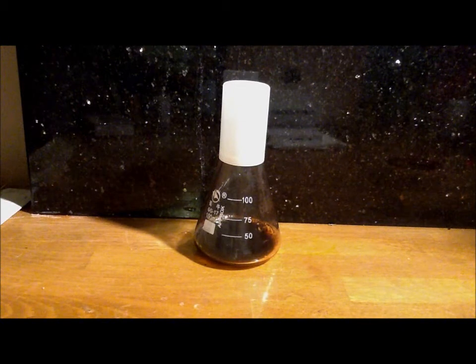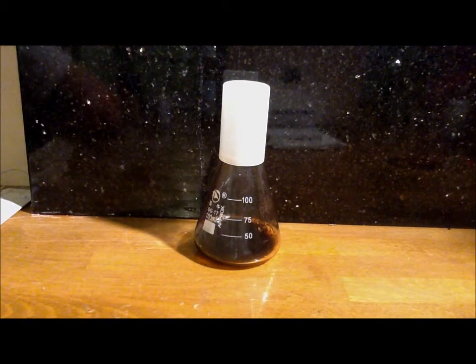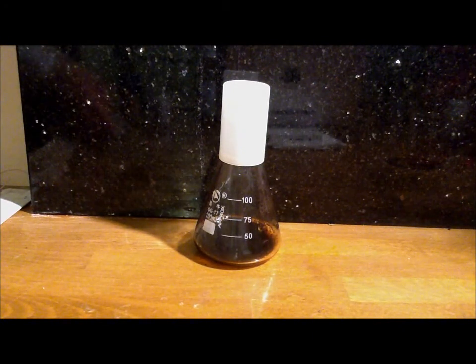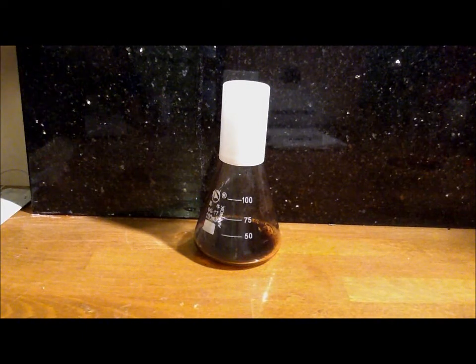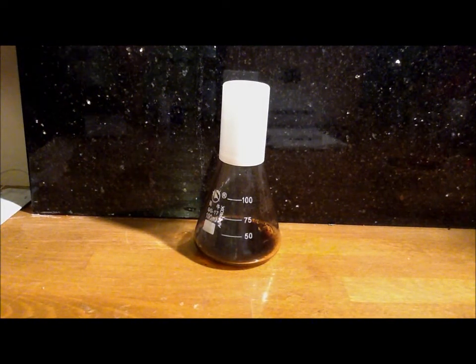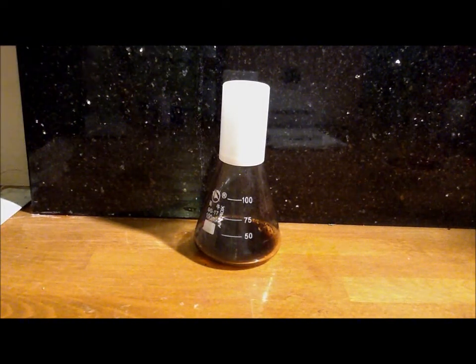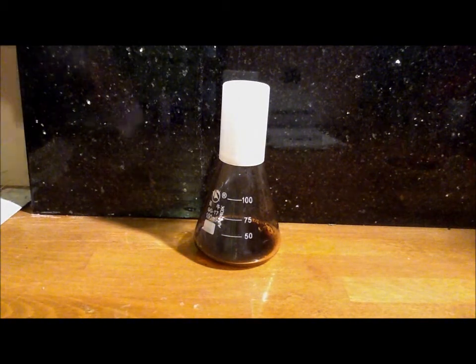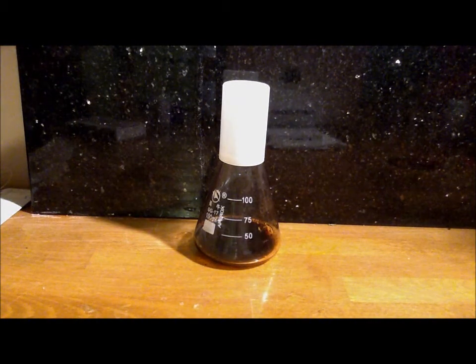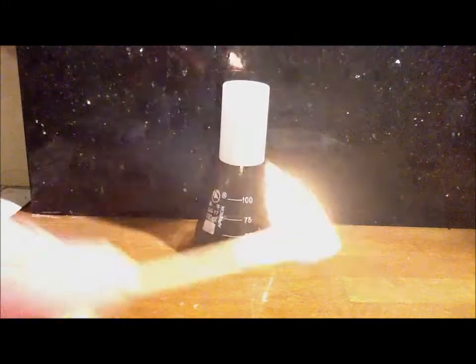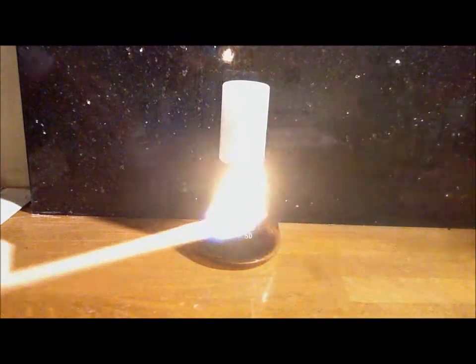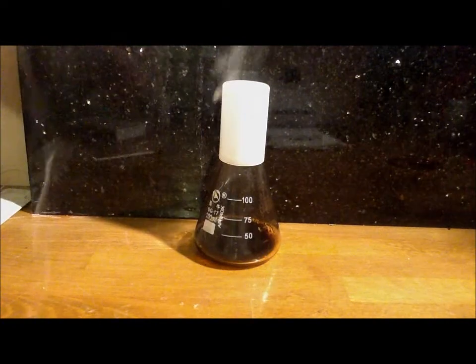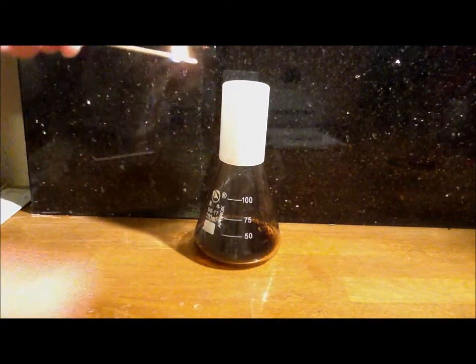Then you need to light your splint. Then you need to blow it out and then re-light it in the conical flask.